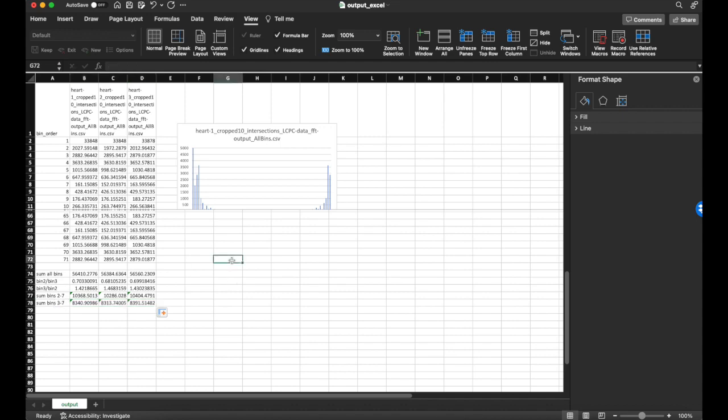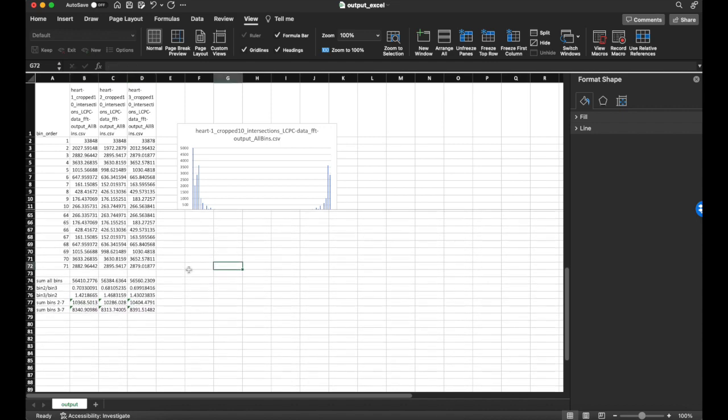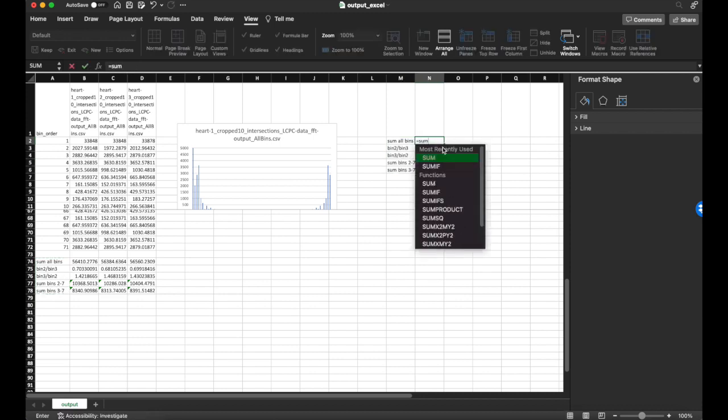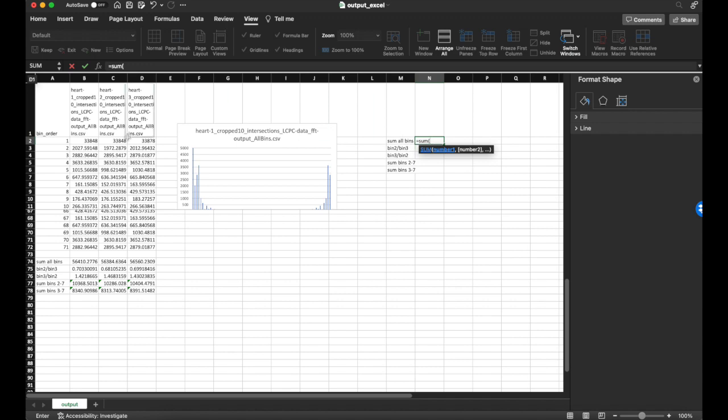And so here's something very important. I could have calculated each of these three up here, right? It doesn't matter because when I press in the equation here, it tells me to search for which range I want to calculate. So it doesn't matter where I place these calculations.